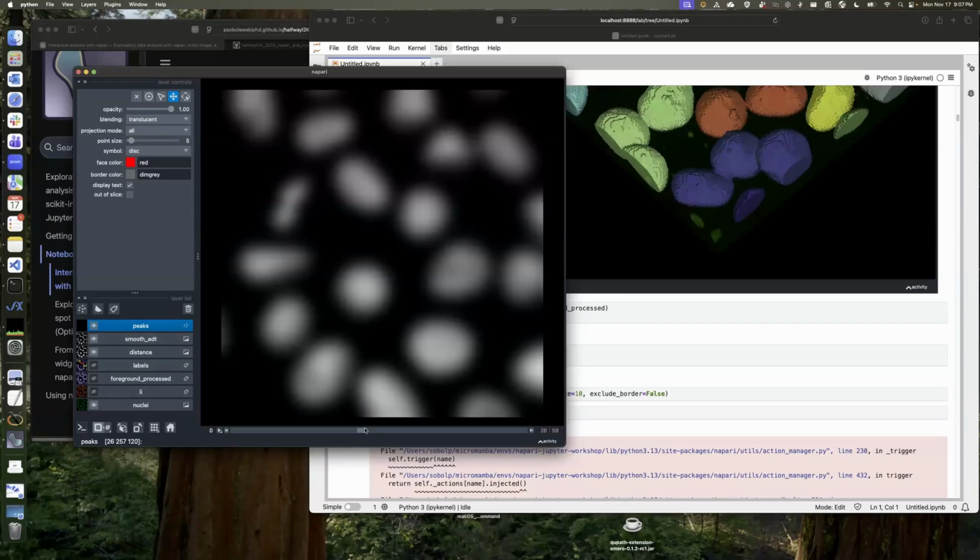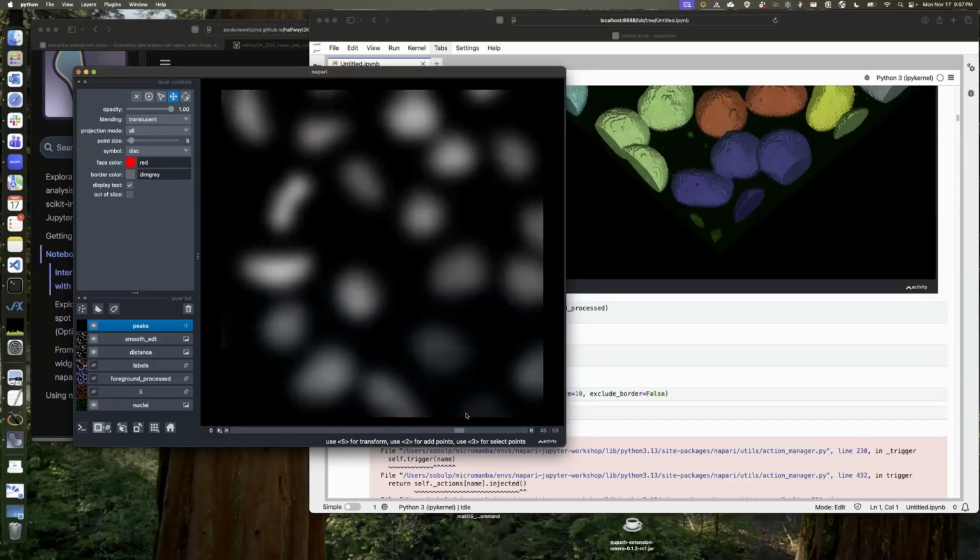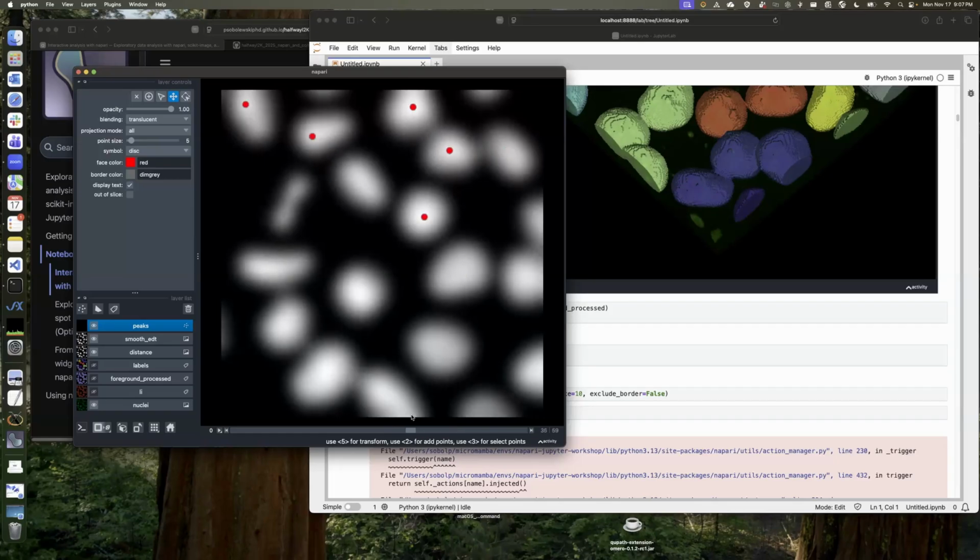I'm not exactly sure why that was happening, but it was very unhappy about that. It does look like overall, if I'm just scrolling through it, that everything looks pretty good.